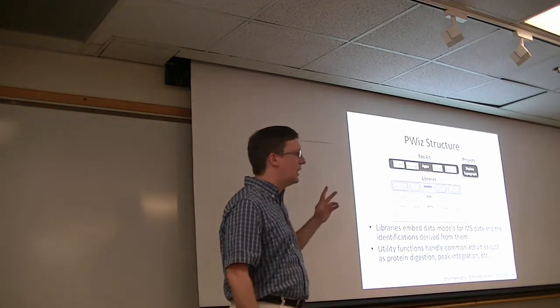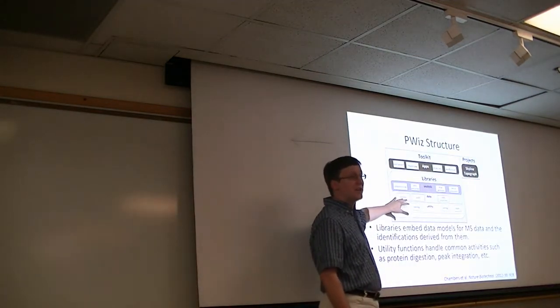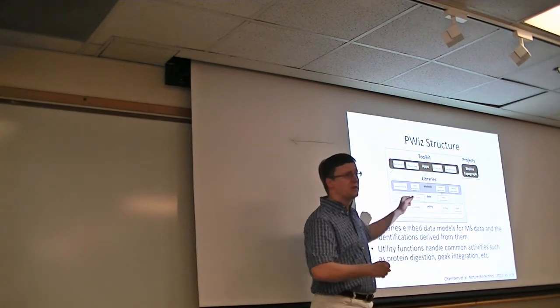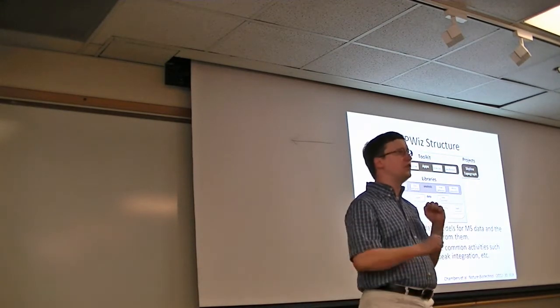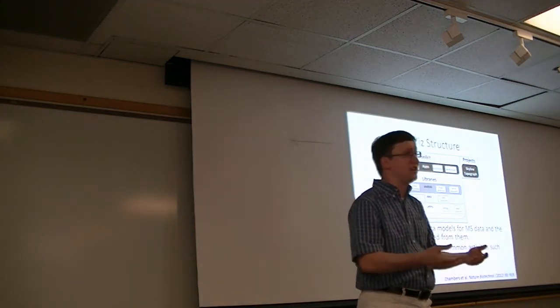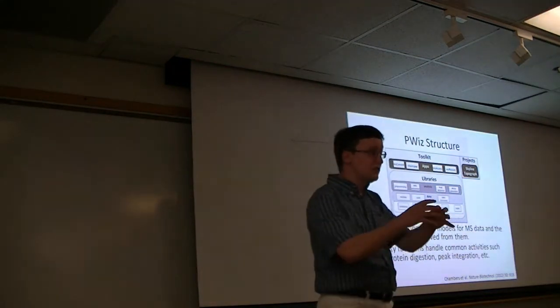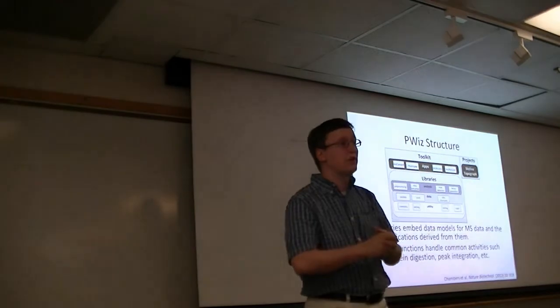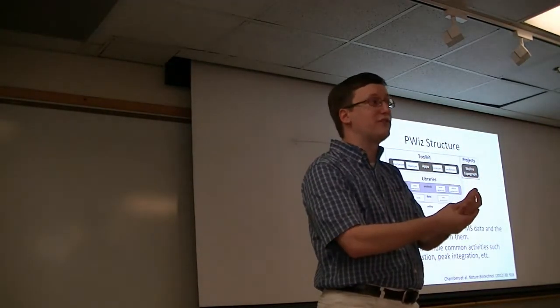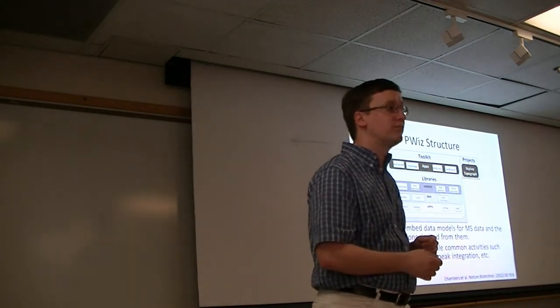Just to give an example, there are some functions within the library that you don't get access to unless you're writing code that calls ProteoWizard. So if you have a peptide ion and you want to predict which fragment ions would occur if you were breaking this peptide under ETD conditions, there's no binary front end for that. But those library functions are still within ProteoWizard. So when MyriMatch figures out which fragments to predict for a peptide ion, it's doing so by calls to those functions within ProteoWizard.